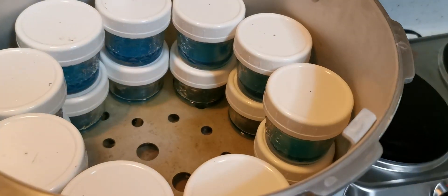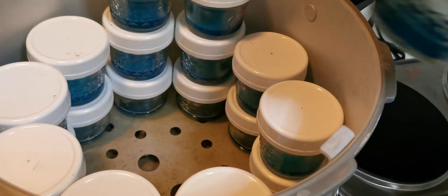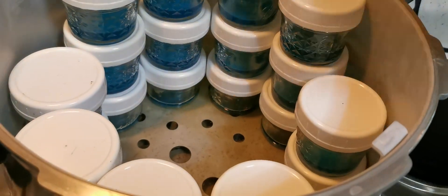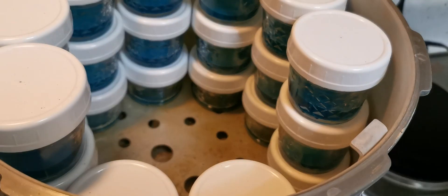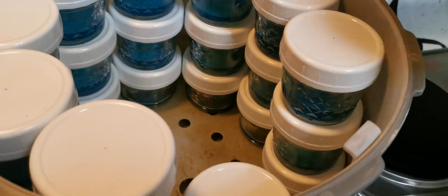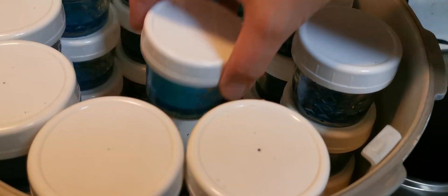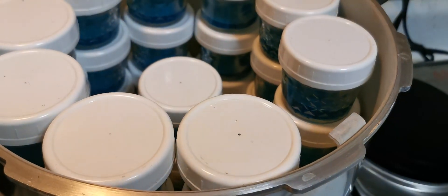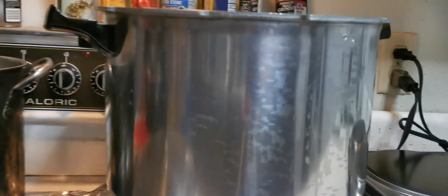One of the advantages to this method versus the traditional pouring of plates is your plates are sealed up and they stay sterile until you use them. You don't have to worry about wrapping them with parafilm. And there you have it — much love.